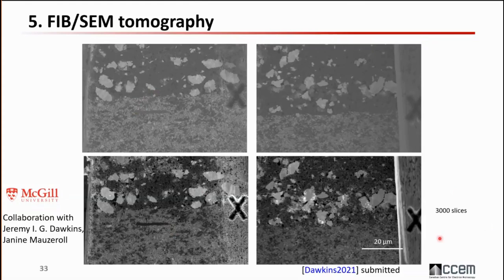Another thing I forgot to mention at the very beginning is that with the gallium, when you do the tomo, you might need to refill your gallium during your acquisition, which is not stable. Comparing to the xenon, I have even run some experiments for 1 week without any problem. The objective of this study is to look at how this interface looks in 3D.